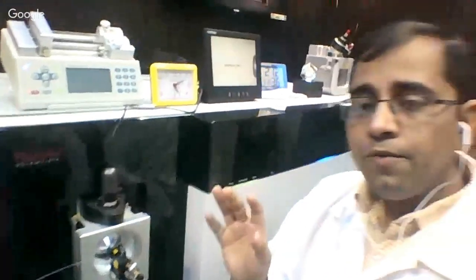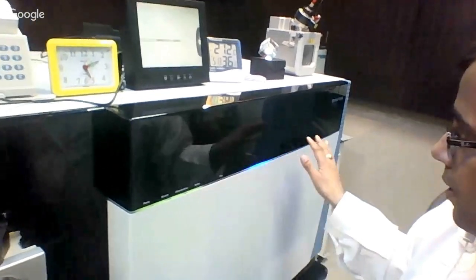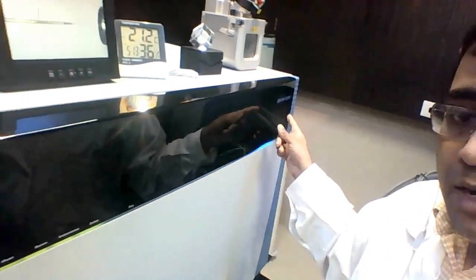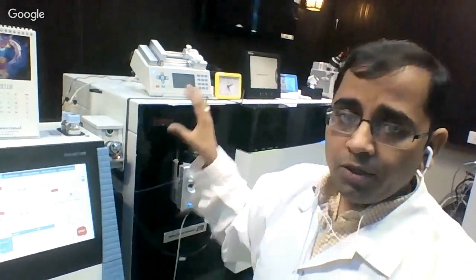What we are explaining to you is one of the latest technologies in the field, the Orbitrap Fusion. If you see the label here, this is one of the latest technologies which offers the highest resolution for protein analysis and for proteomic separations. It is a very unique platform. Although we have not talked in the course about all the possibilities for different mass analyzers, just to give you an idea, we are talking about protein mixtures and we have to separate them well, so we need different properties to separate and analyze them.